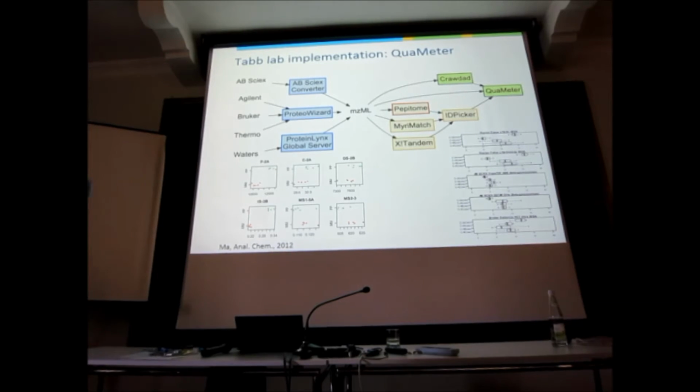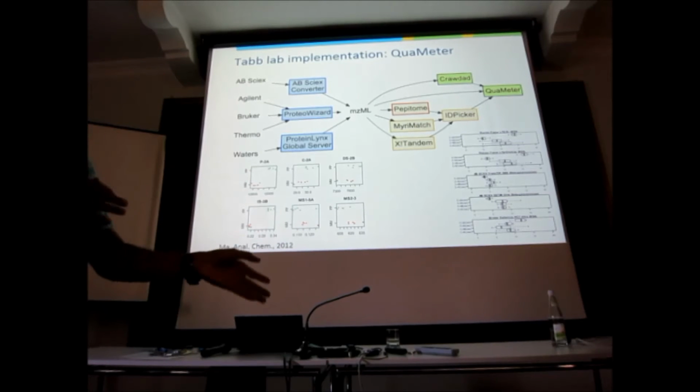Meanwhile, Proteome Software, the guys who make Scaffold, implemented this as a paid add-on into Scaffold. The problem is nobody wanted to pay for this. Why would you not want to pay for this? This is worth a lot of money. Anyway, they did not, and thank God, these guys now threw it in the open source domain. So we can take this code, and Bas van Breukelen is now working with them to get this code and to make a free tool out of it. So hopefully, this will soon be in everybody's lab.